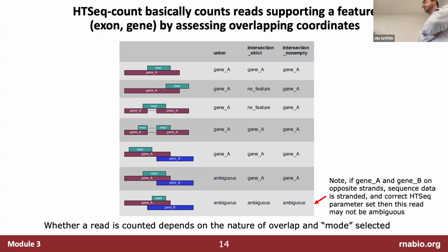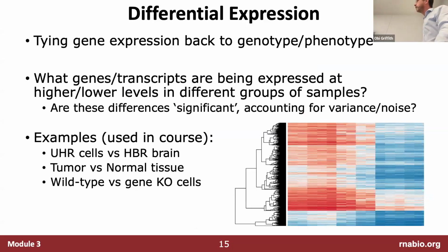We'd have to read the featureCounts and HT-seq documentation to see if they have an option about that. It would either have to do something simple, where it makes a simple assumption, like if there's an ambiguous read, just assign it to the higher one, or it could do something more sophisticated, like I was talking about, where it could think about, given all the other alignments to these two genes, which is more probably the gene. Yeah, something like that. It's a good thought. I'm not aware, off the top of my head, of a tool that does that, but it's a valid thought. Any other questions?